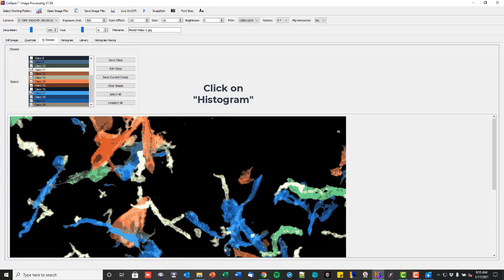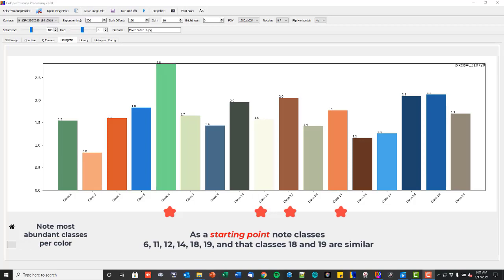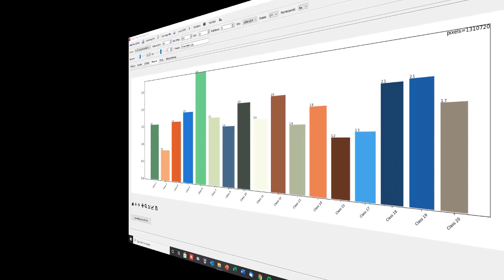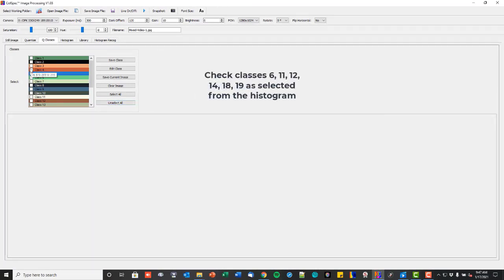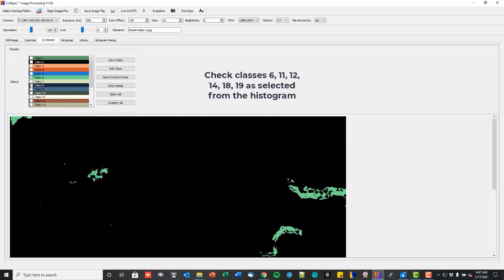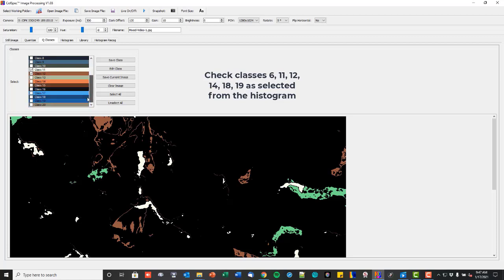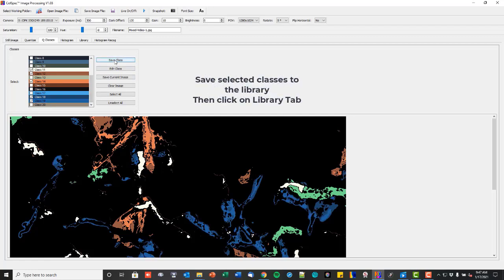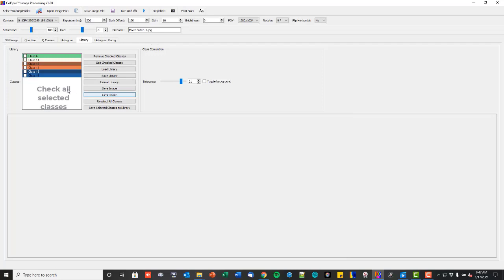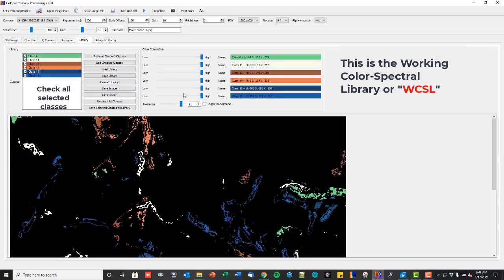Click on the Histogram tab. As a starting point, note one dominant class of each color. In this example, we select two classes for one color for illustration. Uncheck all classes, then check all classes identified in the Histogram. Clicking on the Save button loads selected classes into the library. Click on the Library tab — you have just created a working color spectral library.